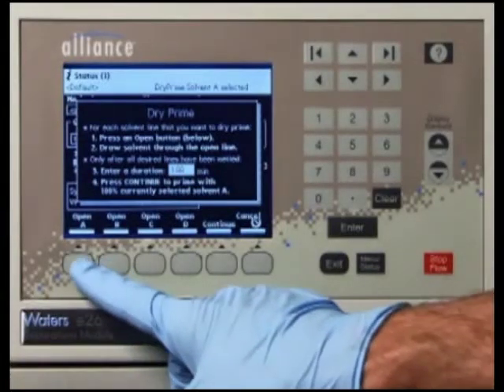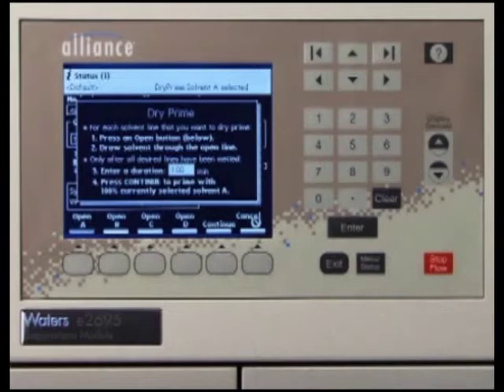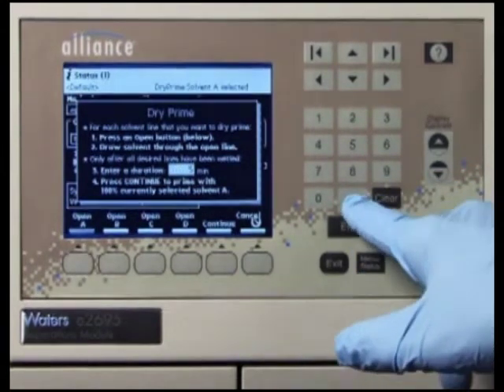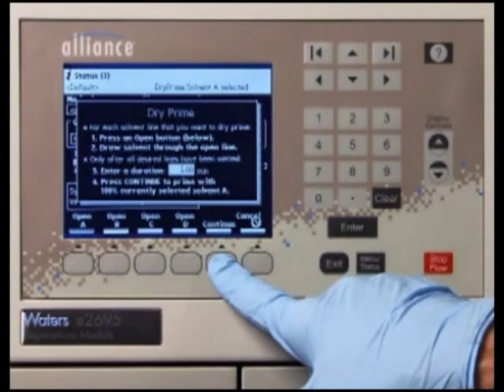Press the screen key corresponding to the solvent line with which you want to prime the system. Waters recommends that you prime using the solvent with the lowest viscosity to help purge air from the lines, especially if the inline vacuum degasser is installed. In the Enter a Duration field, enter the length of time, in minutes, to prime the solvent management system. Start with a value of 5 minutes. Press Continue.